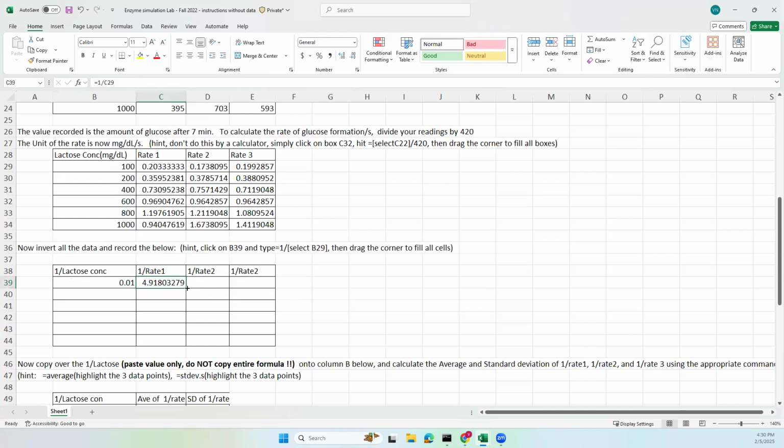As I said, once you've done one, you can just drag to the other one. That's what I like to do. Or you can copy and paste. Copy, go to the next square, paste, and that will also copy the same number. Same here. You can just go to the right corner and drag down. Or you can just copy and then paste to go to the next square. So Control C, Control V.